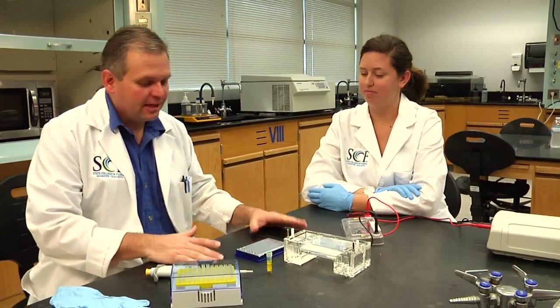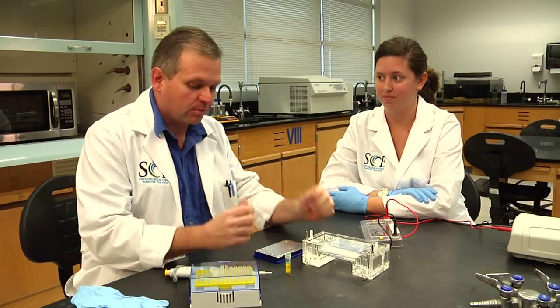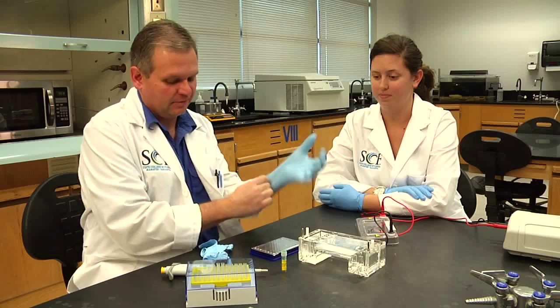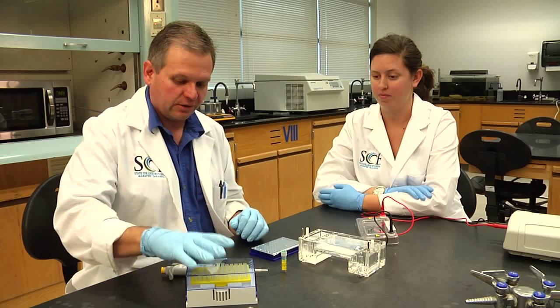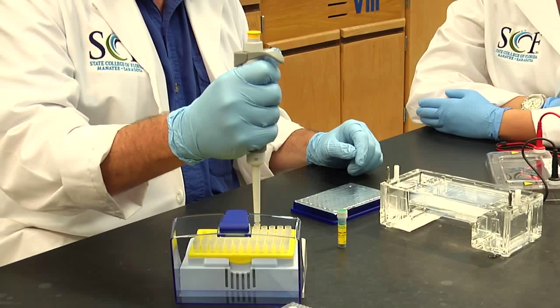Lindsey is going to help me demo a few things that would happen after we're done performing the PCR reaction. It's all about running a gel — analyzing the samples on a gel. What we're going to do here is add what's called a load buffer tracking dye to our samples, and we're going to use some of the great pipettes we got as part of this new program.